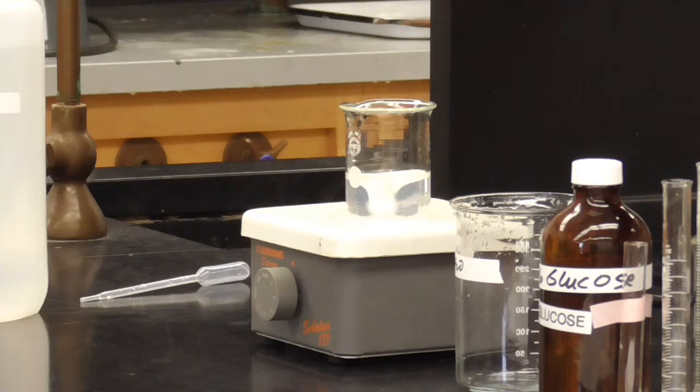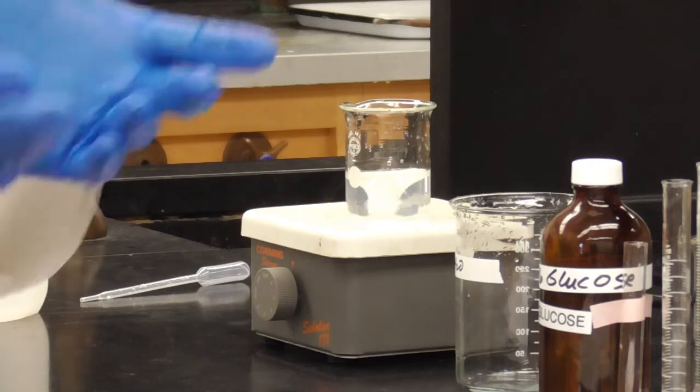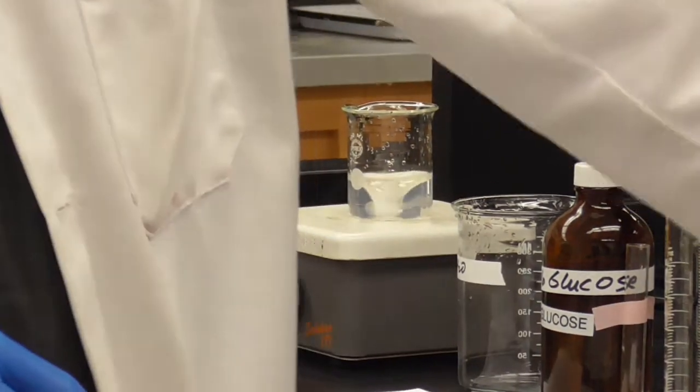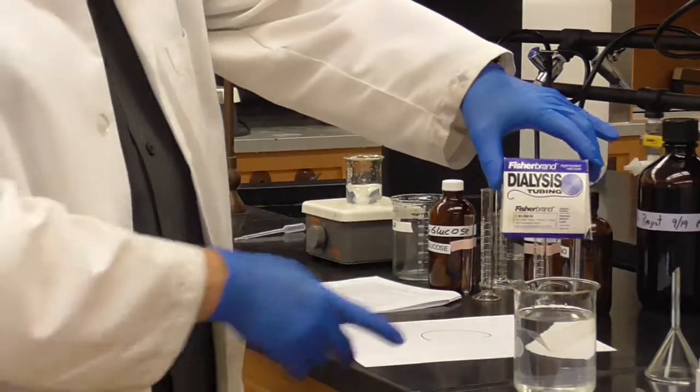Of course, it's a little more complicated than just big and small. You also have the idea of whether they're charged or whether they're not charged, polar versus non-polar. You even have facilitated active and passive transport. So it's a little more complicated, but it is semi-permeable down to it. And so we are going to mimic cell membranes by using a semi-permeable membrane called dialysis tubing.